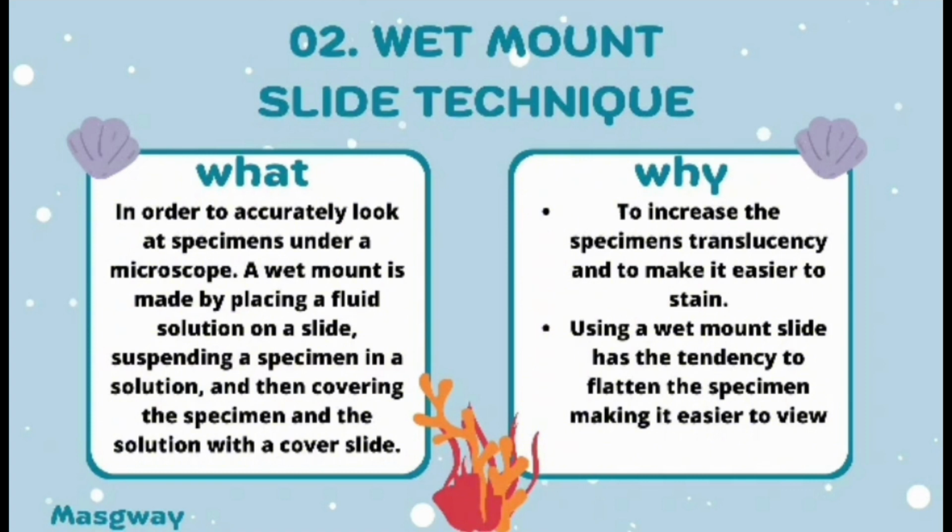Why? First, it is to increase the specimen translucency and to make it easier to stain. And secondly, using a wet mount slide has the tendency to flatten the specimen, making it easier to view.